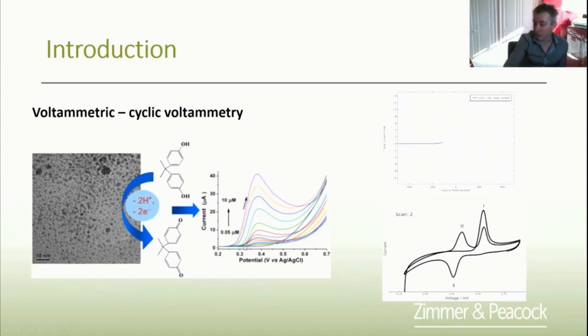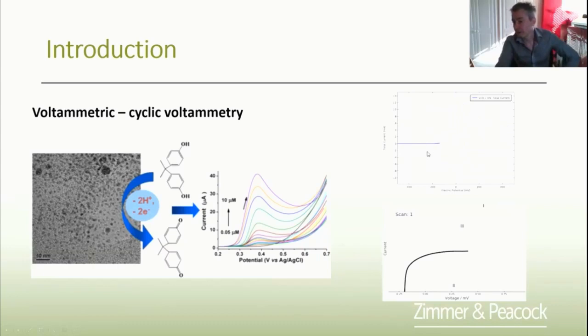We are going to discuss why it's this shape, but in some ways, you didn't have to know why it was this shape. You could actually just accept that it was this shape, but we will explain why cyclic voltammetry has this particular shape. And in this example, they're showing you that they're going from 0.05 micromolar to 10 micromolar, and the peak height is increasing. So electrochemistry or cyclic voltammetry will give you peaks, and those peaks will be proportional to concentration. So now you have something that's proportional to concentration, and that means you are sensing. Whether you are sensing it specifically or non-specifically, you could have lots of things that could give you a current. So there's another conversation about specificity, but it is sensing because it's giving you a peak height that is proportional to the concentration. And I've got a couple of animations running alongside this. The animation at the top here is ferricyanide.